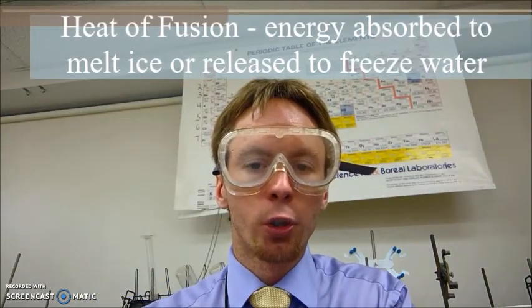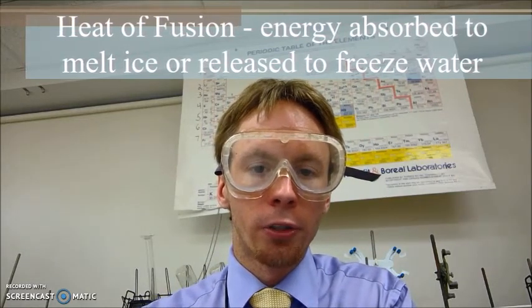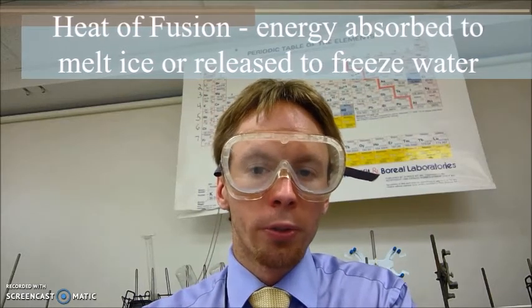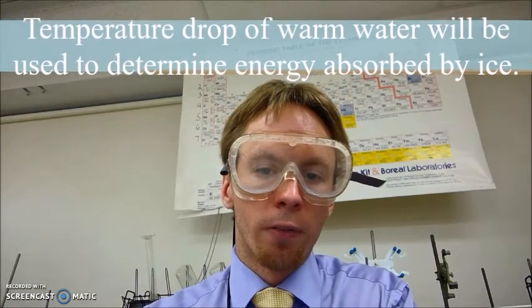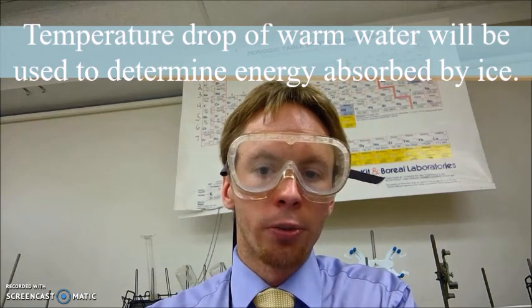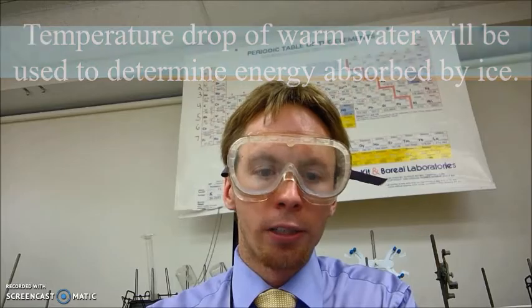The purpose of this lab is to determine the heat of fusion of H2O, or the energy that it takes to melt a sample of ice or to freeze a sample of water. What we're going to do is we're going to take a sample of warm water, get a specific amount of it, and then add ice to it. The temperature change of the warm water as it cools down, we'll use that to determine how much energy was required to melt the ice that we put in the first place. So let's go ahead and get started.